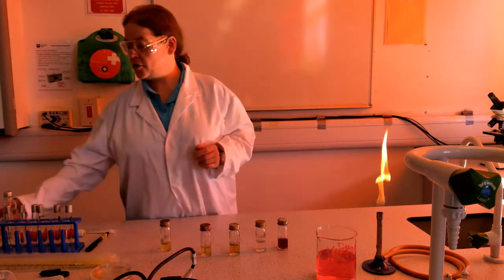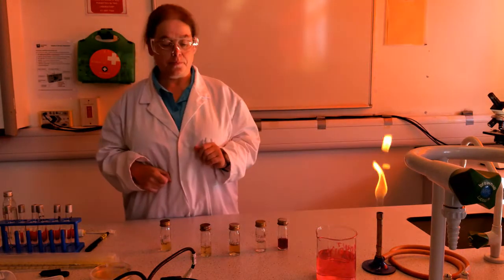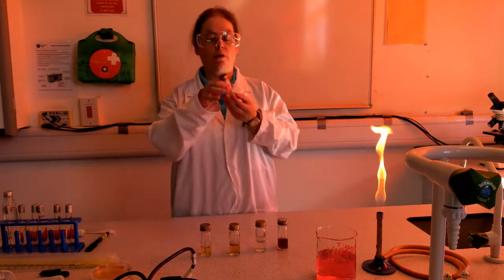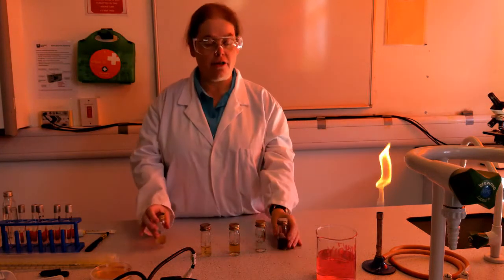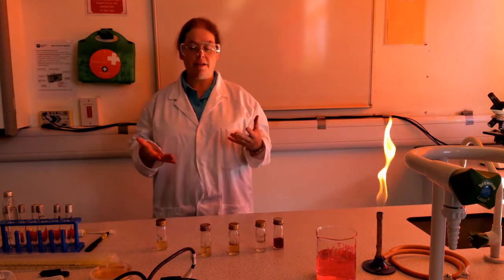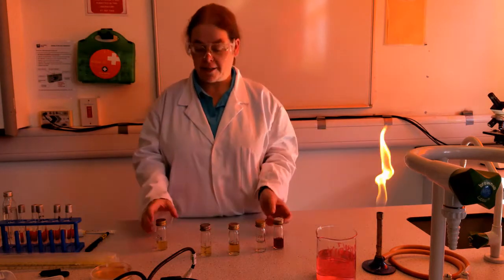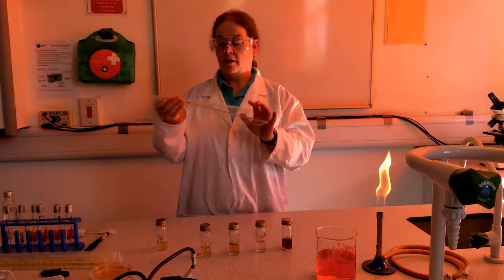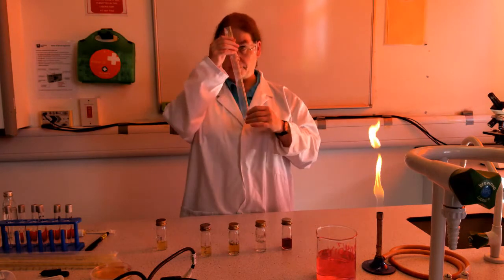So, what we are going to do now is inoculate the culture. Obviously, the idea is to place the same volume of the bacterial culture into the same volume of each of these growth media to see which one is going to grow the most bacteria. I'm not going to waste your time inoculating all four, but I will just demonstrate inoculating one of them.